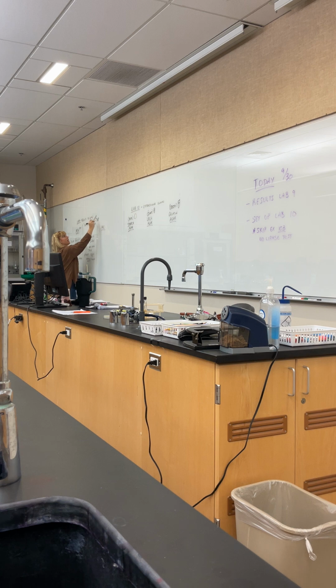And I mentioned last time that dyes can affect the growth of gram positives. If I'm trying to build a thick lasagna layer and I am a gram positive, those dyes kind of get in the way and they make my layers slippery. And so my layers have a harder time stacking, and so it kind of falls apart. So if I put a gram positive on EMB, it is inhibited because of the dyes.